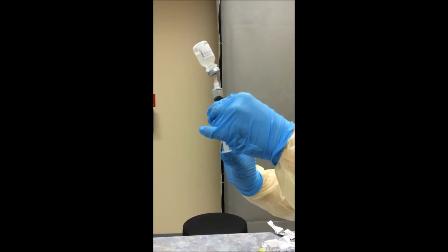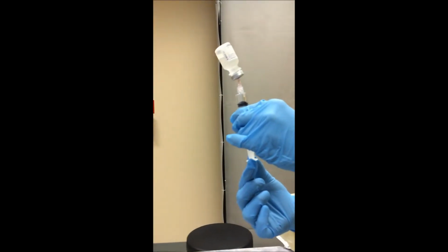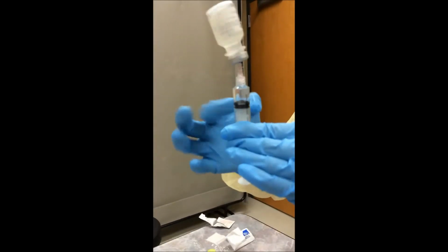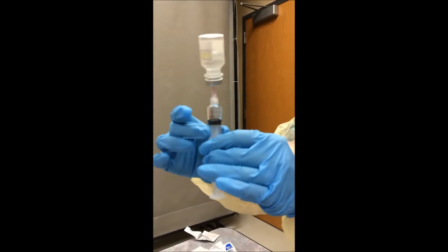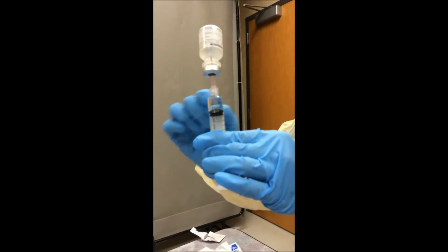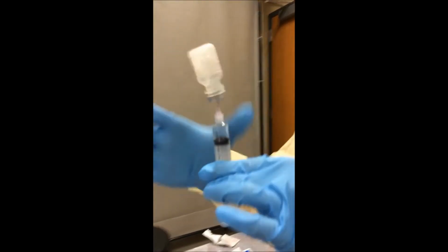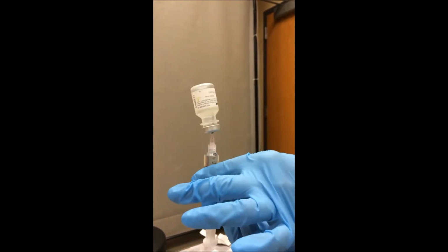Now you're gonna have air bubbles. It's okay. You can get rid of them momentarily. And you see it's at 3 mils. And you just flick it, or I like to use my thumb and get rid of them. And as you can see, majority of those air bubbles are gone. I still have a couple, but for the purposes of this, it's okay.